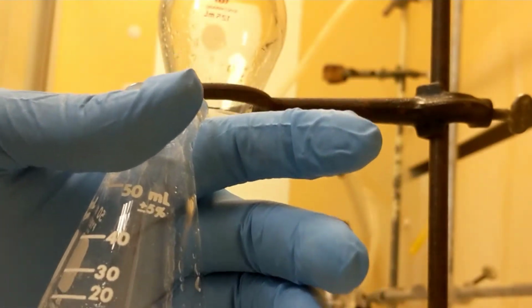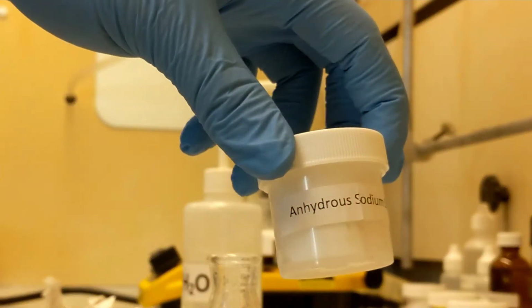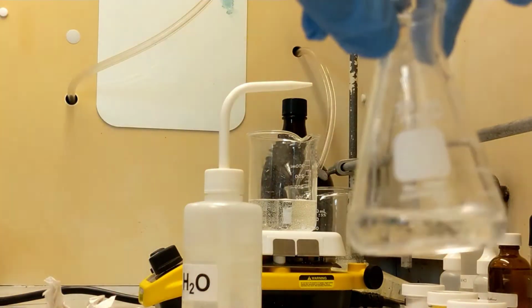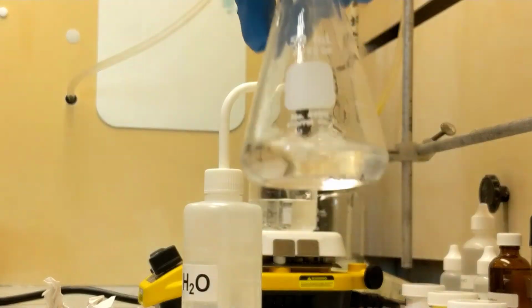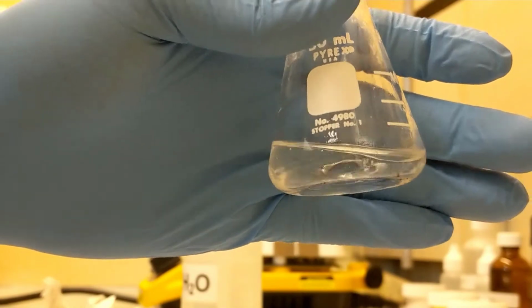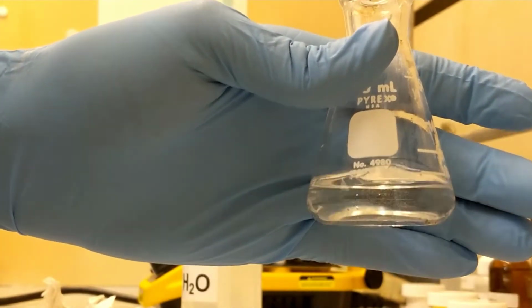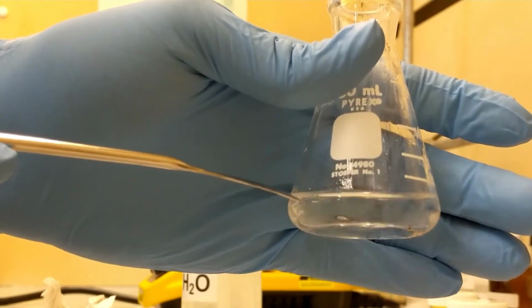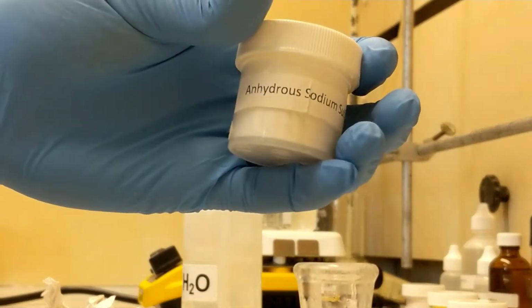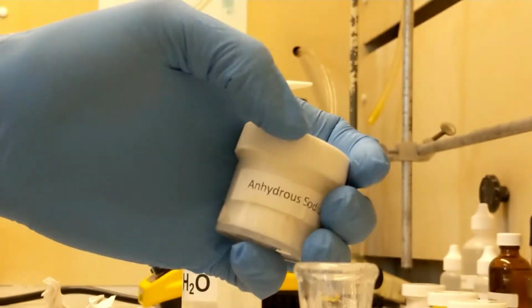I'll see y'all then. Alright, now I'm just going to add some anhydrous sodium sulfate to my wet methylene chloride. By wet, I just mean that it has water in it, okay? So yes, it's a liquid, but it is only wet because of this tiny layer of water in it, okay? So what I'm going to do is add this until it doesn't clump at the bottom, and I'll show you what that looks like. And then I'm just going to let it dry, and then we'll come back.